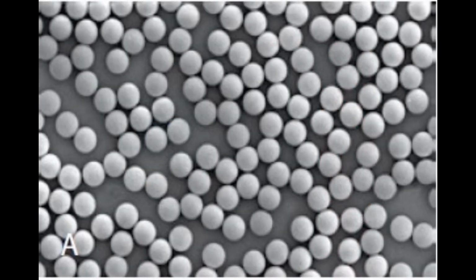Dynabeads are 1 micrometer diameter spherical magnetic particles that react to magnetic fields. The beads are composed of an iron core surrounded by a polymer layer that can be functionalized with several affinity components, such as antibodies, ligands, metals, etc. Here we are going to show the process of protein purification by using cobalt functionalized beads to bind histidine-tagged proteins. In short, it's an IMAC method in suspension.